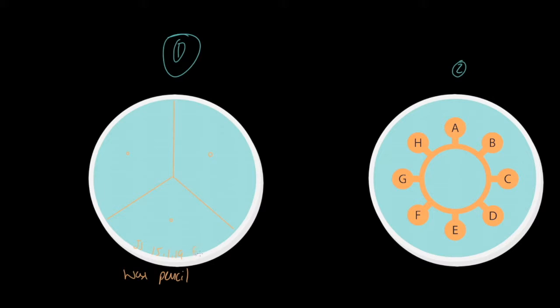And we're going to write on here that this is E. coli. Okay, now once we've done that, we're going to turn this over, and effectively what we are going to do is apply our antibiotic discs. We're going to apply them onto these spaces, onto these areas.